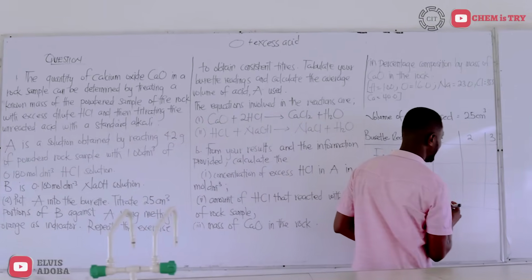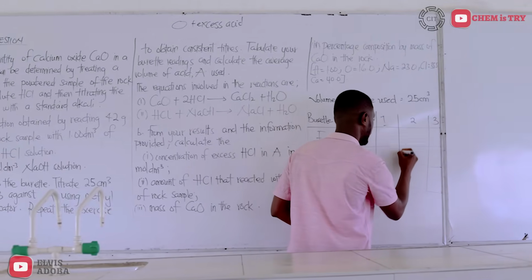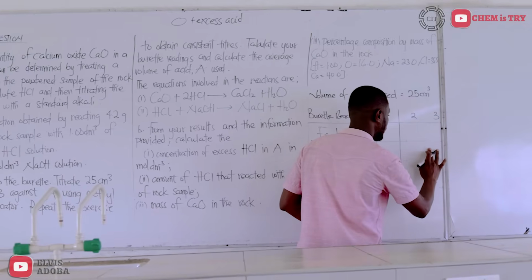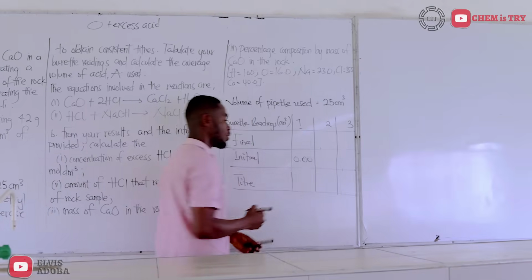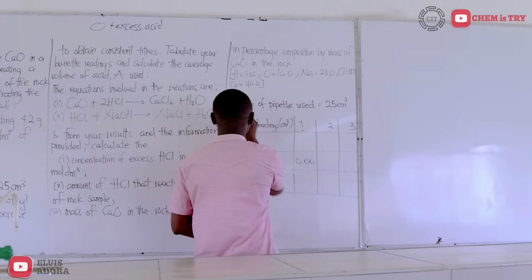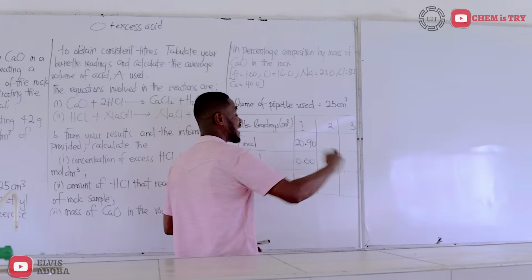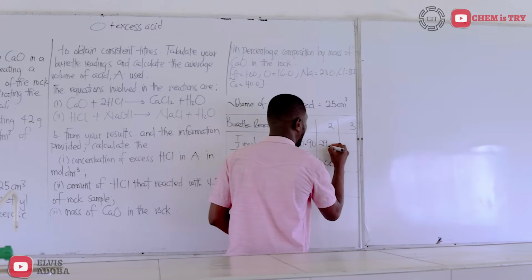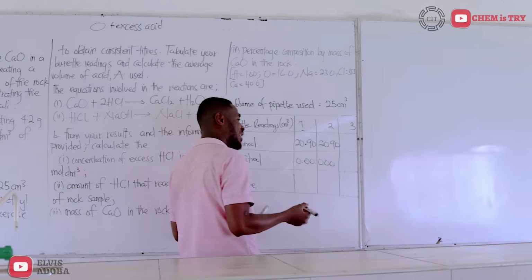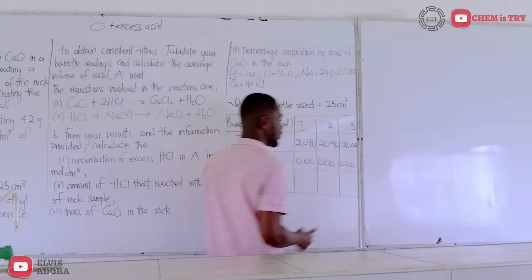So in our first titration, we started from 0.00 on the burette. Then we ended at 20.90. In our second titration, we began at 0.00 and we had our color change at 20.90. So in our third titration, we will assume we started from 0.00 again and we ended at probably 21.00.